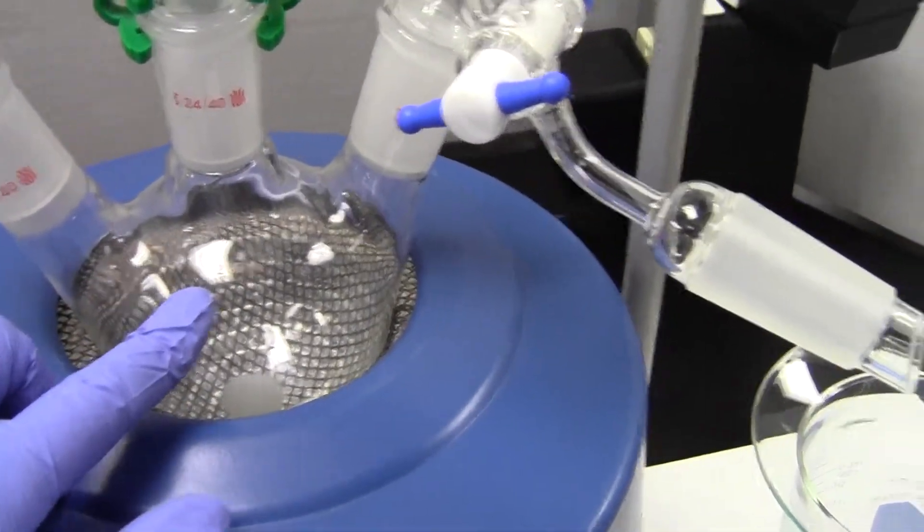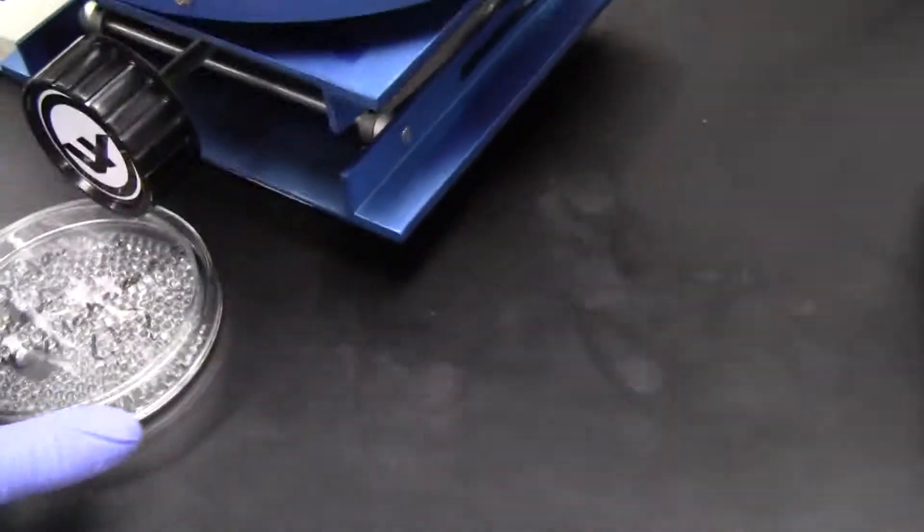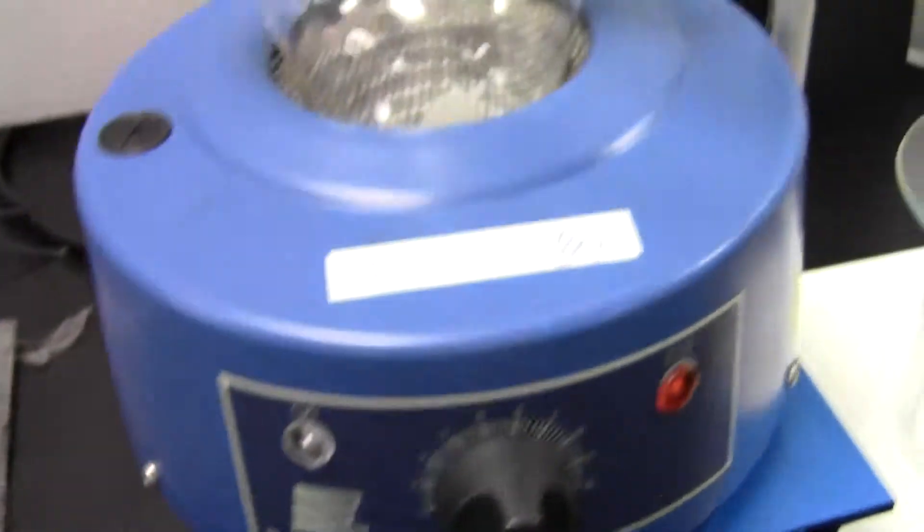This will bump. There are glass beads here, so you want to put some glass beads into your flask. That'll prevent bumping because this is not being stirred while you're boiling it.